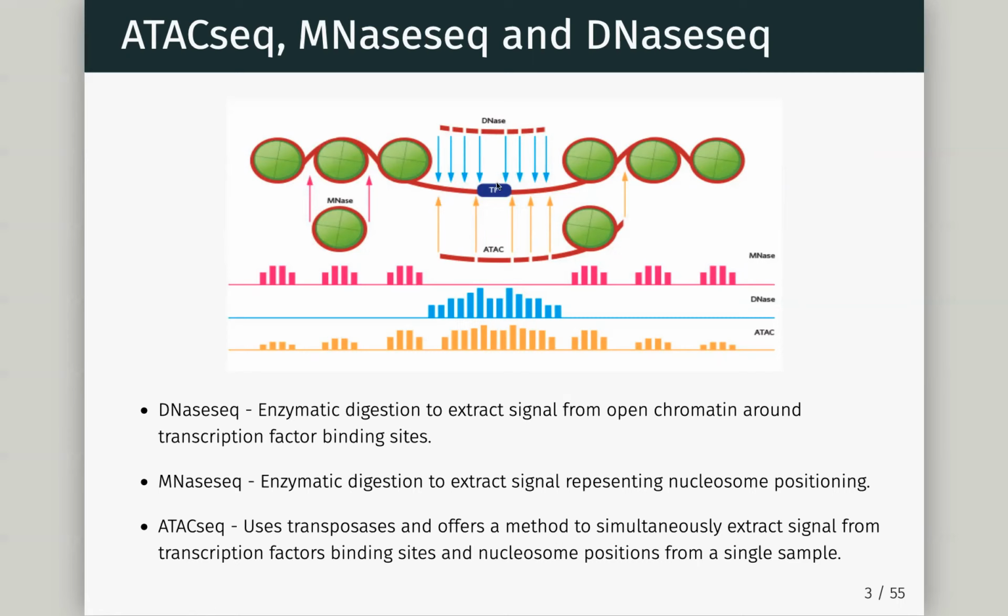So then the question is, why do they limit it all the way down to 100 rather than 100 to 147, just to be sure? They don't want any of this overlap because they really wanted to be sure that we can consider it open chromatin. Was that the question? Why isn't it 147 and below? If it was much bigger than 147, we would start to contaminate our open chromatin, nucleosome free, sorry, with fragments which could have come from nucleosome.